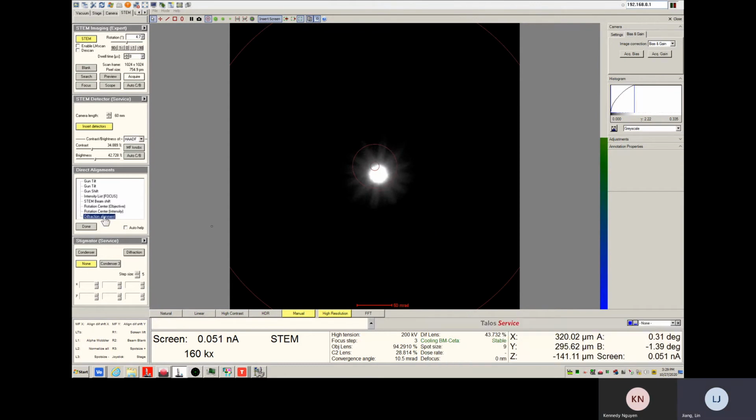And then this is a very short command. So then you go back to normal commands. And then okay. And then we can go.